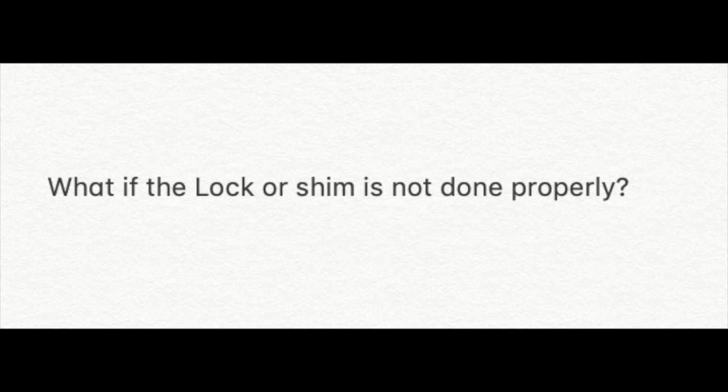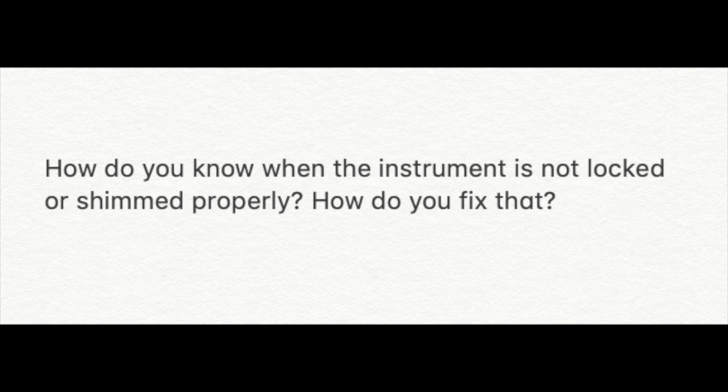It is very fragile. You'll know if the instrument is not locked or shimmed properly when you get your spectra back, or if there are any errors that occur when you're running the experiment. And how you fix that is you'll have to restart with the locking and shimming process. This is an easier thing to do when you're running a proton and it's only a 20-second experiment, but if you're running it overnight, you really want to make sure you have the correct lock and shim before you run it. And you can do that by running a proton first and making sure you're getting a good spectral read before running an overnight.